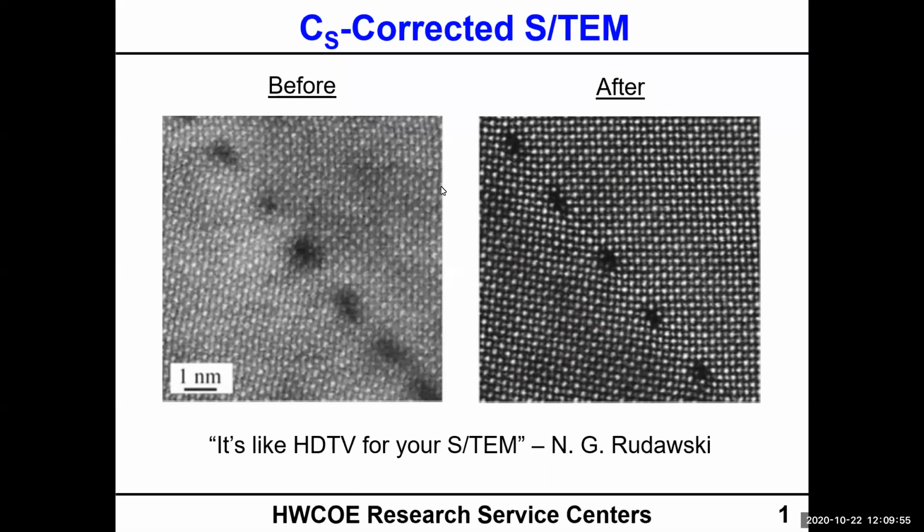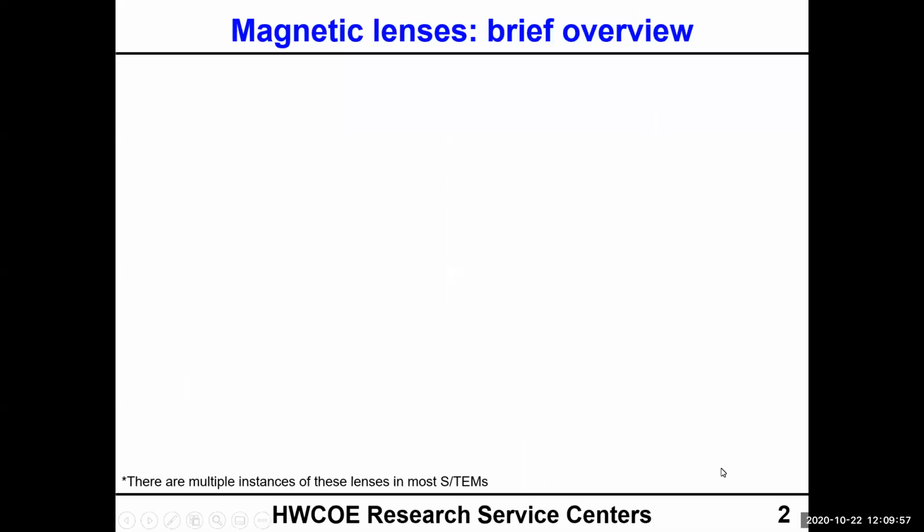All right, just a little brief history here. I didn't want this to be too math heavy, so it isn't going to be, but we are going to talk about the origin of this term C sub S and what it means.